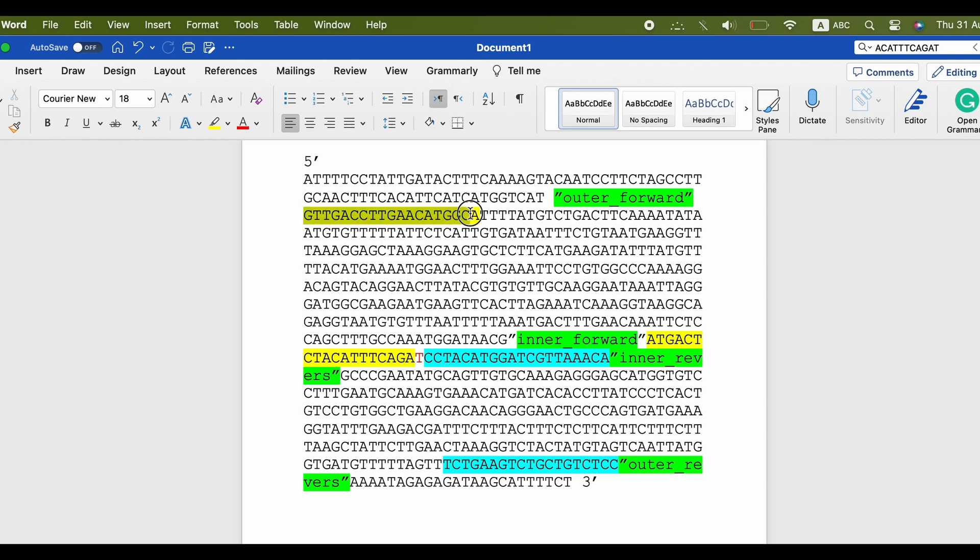After you pick the primers to make sure they work, go to Insilico PCR website and paste the primers as you see.